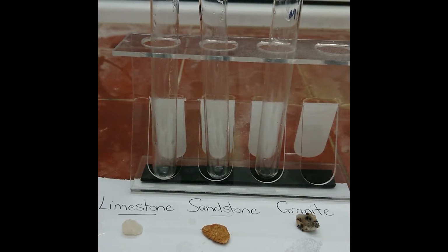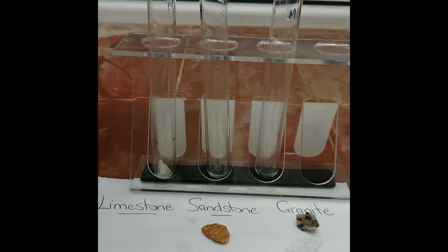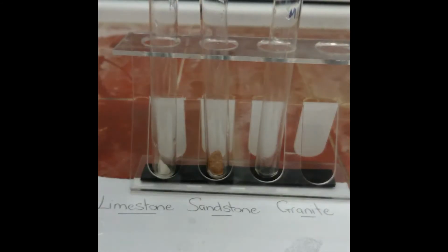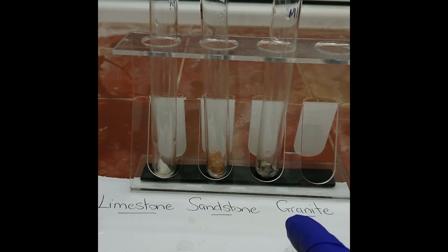Okay, because I'm using a highly concentrated hydrochloric acid, I am at the moment in the fume hood, hence the noise. I have my gloves on, I have my lab coat on, and I have my safety glasses on. What I'm going to do is place each of my samples of rocks in the test tube, and then using a plastic pipette, transfer some of the acid into each of the test tubes. I'm also going to add a timer just so that I can keep track of how long this experiment will be running for.